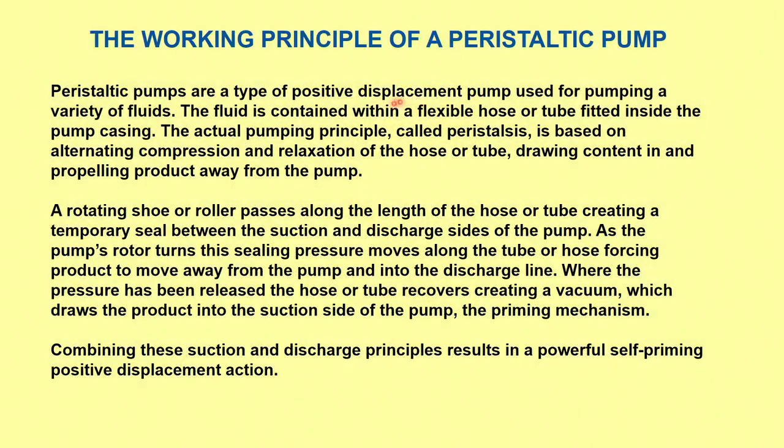So, this is the working principle of a peristaltic pump. They are positive displacement pumps used for pumping a variety of fluids. The fluid is contained within a flexible hose or tube, which I had shown you in the previous slide, inside the pump casing. So, the actual pumping principle is called peristalsis.